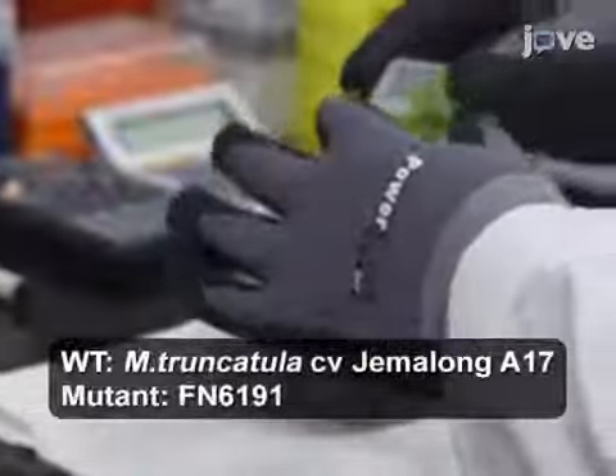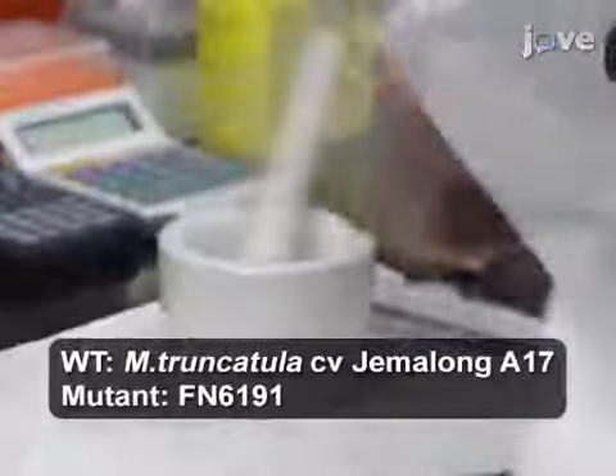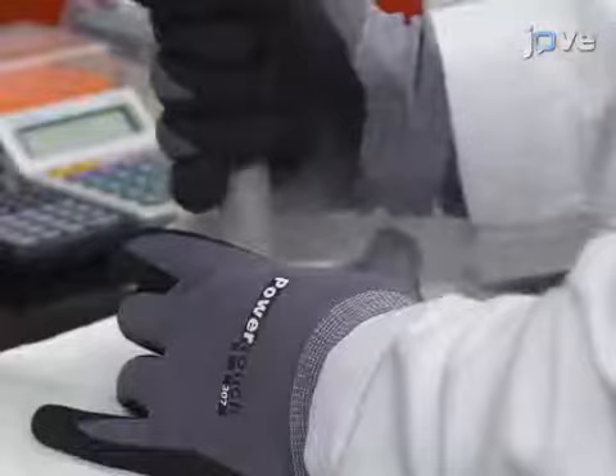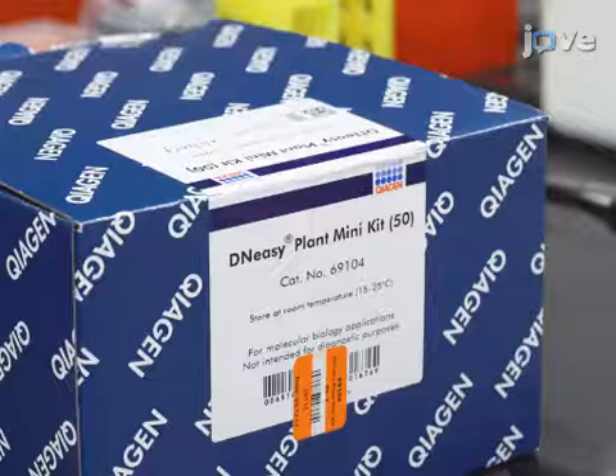Quickly freeze one gram of young leaf tissue collected from single plants in liquid nitrogen. Then use a mortar and pestle and grind the frozen leaf tissue to fine powder within the liquid nitrogen. Extract the wild-type and mutant genomic DNA samples from the fine powder using a DNA isolation kit.